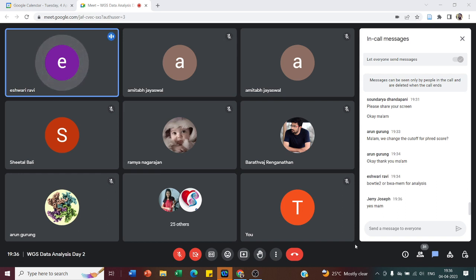I will share the detailed logs including each command and installation link, so that should not be a problem. And tomorrow I will go through the entire alignment and everything as well, so in case you missed some problem somewhere, we can always understand.